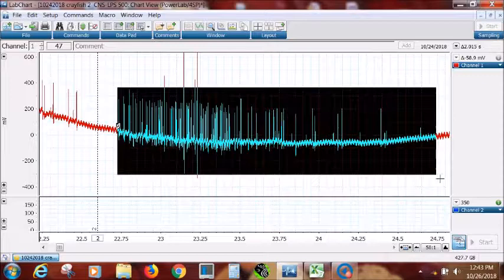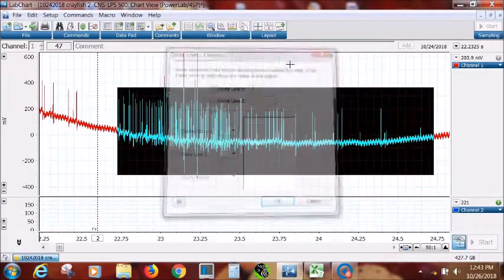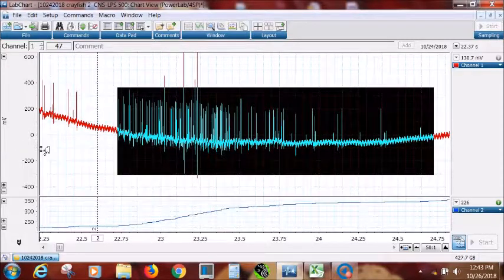Or what is going to be accurate enough right there. Then we can go back over here and click our M. Notice the trace disappeared here, and it's because it went off the chart. So you can just click over here and, whoops, I clicked too much. You click here and you do auto scale. Autoscale will pull it back in so you can see it.